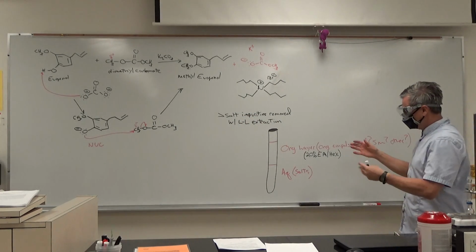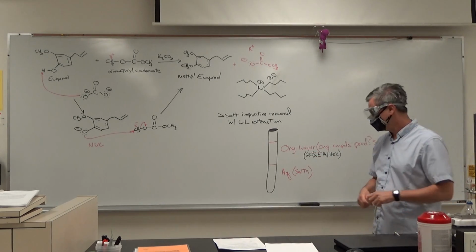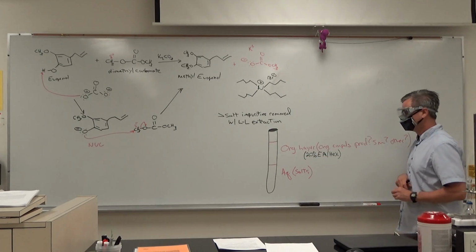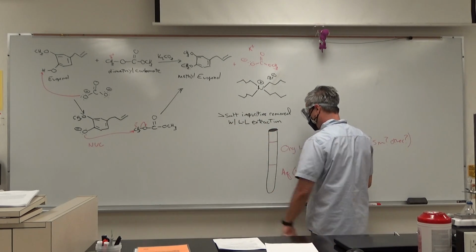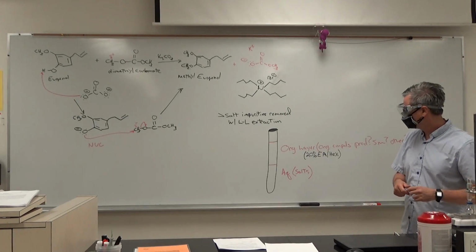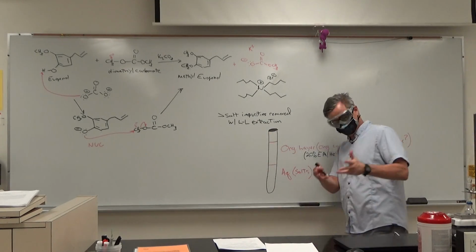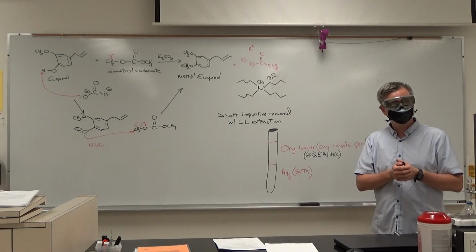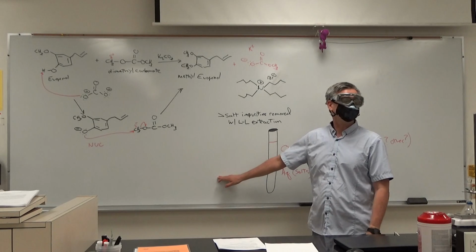So you're going to do a number of extractions. First of all, you're going to get it into the culture tube using the 20% ethyl acetate hexane. Then shake it up, remove the bottom layer. You'll add some more so that we make sure we get all of it. No, I'm sorry, I think you do it the reverse. You remove the top layer. Do it how it's described in there, but do pay attention to whether you remove the top layer or the bottom layer. At the very end, you'll have a tube that just has organic in it.